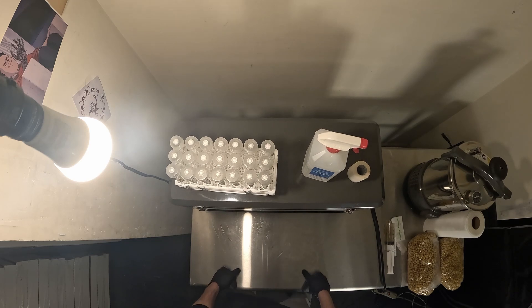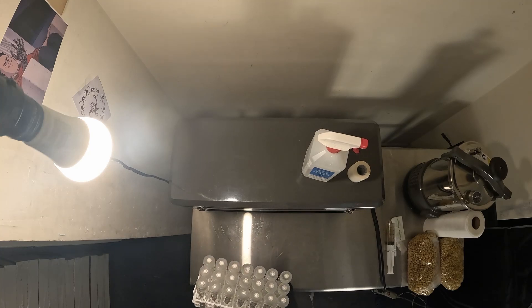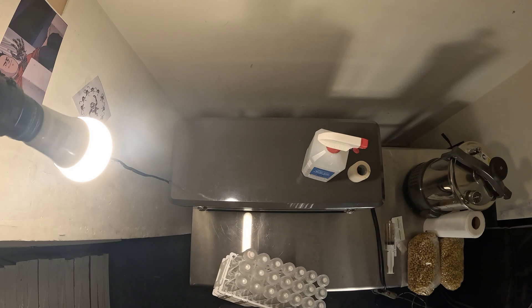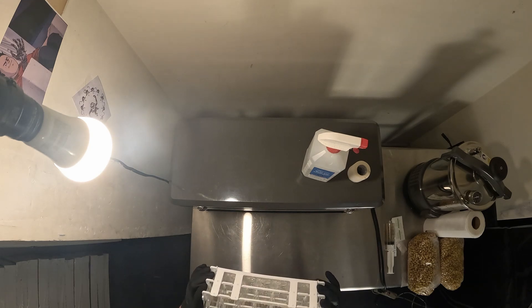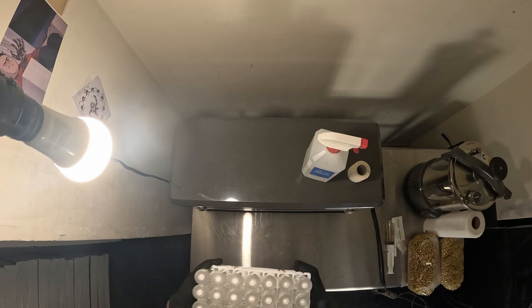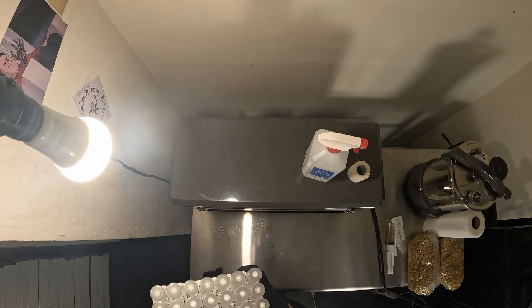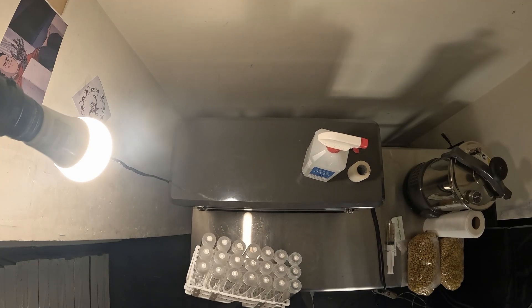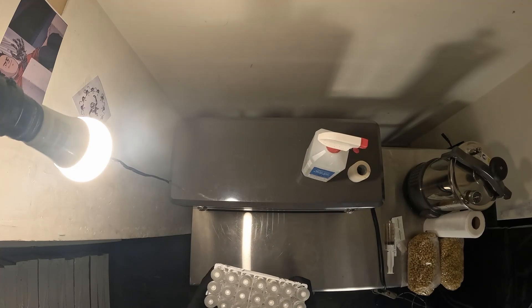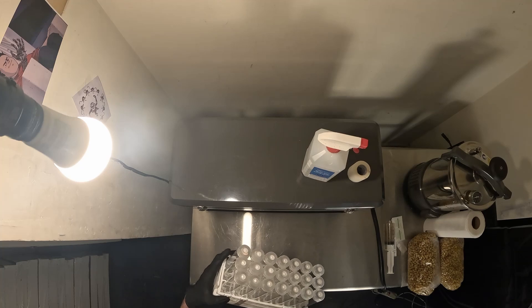When I saw that Athena released one for tissue culture I just jumped on it. What's cool about this is if you're into pheno hunting plants — instead of having to clone your plants before you flower them out, I basically just take a tissue sample and put it in these vessels. This here holds 21 plants, and versus having to grow 21 plants under lights and feed them nutrients, I'm just sticking these in the Athena VPD dome under a low-watt light. For pheno hunting, this thing was awesome — it saves money, saves work, and lets me grow more plants.